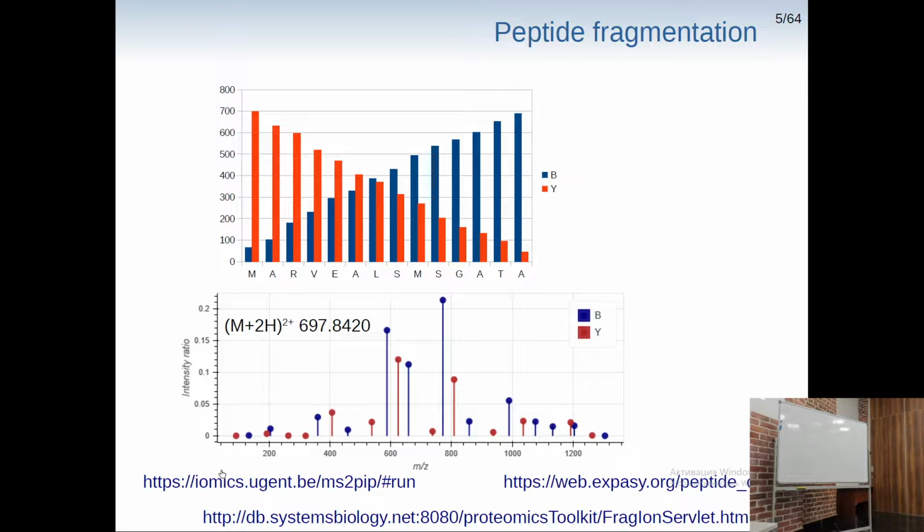You can try to do so with those links. It's a link for Peptide Cutter with different proteases. This one is for making some mock mass spectrometry data in silico, so you just enter your peptide. This program uses a lot of different approaches to predict not only fragments but also their intensity, for instance. And you can use this program to actually try to identify them.